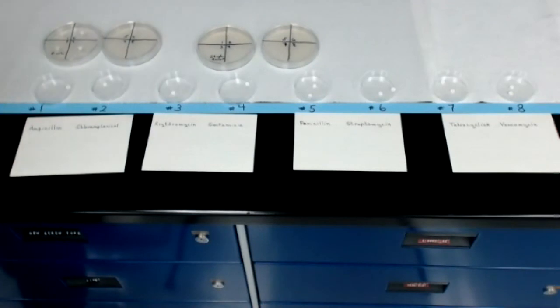After growing overnight, we then will take the plates out of the incubator and we will examine each quadrant on each plate for zones of inhibition. This is similar to what we did with the disinfectants and antiseptics in Module 15. The difference here is that simply having a zone of inhibition isn't enough to convince us that a particular bacterium is sensitive to that particular antibiotic that is on the disc, causing the zone of inhibition. It turns out that you will get zones of inhibition even in resistant organisms.